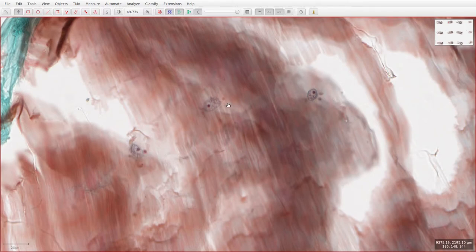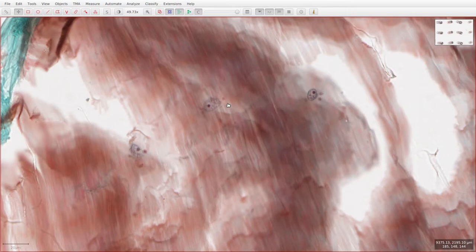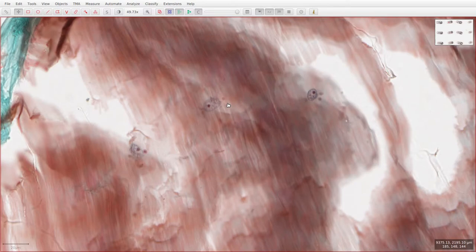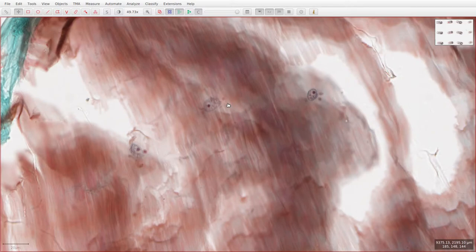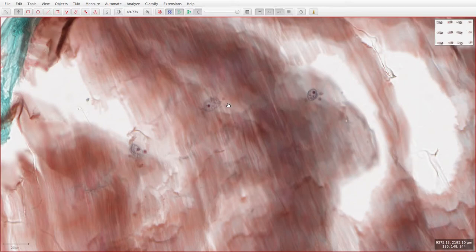The cells of the notochord are actually a kind of muscle cell, which means that they play some role in the motility of the amphioxus. And it's been shown that the notochord's mechanical properties will change in response to nervous stimulation. That makes it very different to the notochord in vertebrates, which has a role in organizing the embryologic development by releasing signals that determine tissue differentiation.